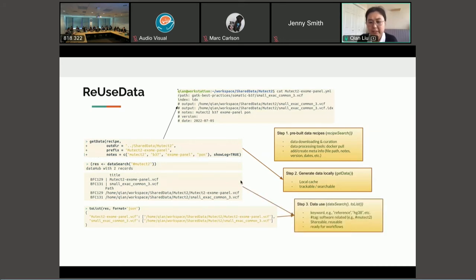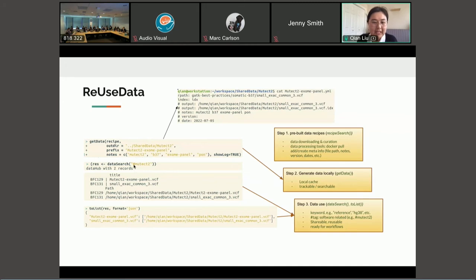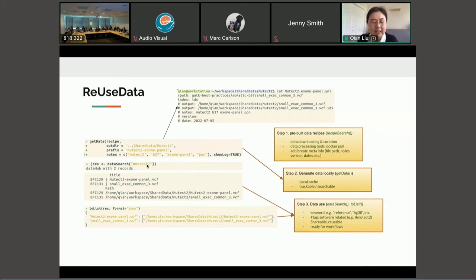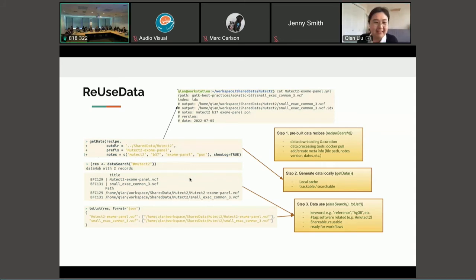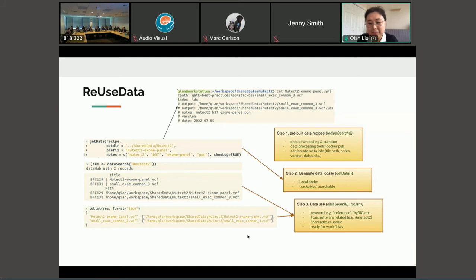The third step is to use the data. We can search the data using keywords by simply adding the hashtag Mutect2 over here. And the specific feature of our package is that we use the hashtag to denote a specific tool that can return all the datasets that can be passed to this tool. So we have functions to add a tag when you generate the data. You can add a tag for the downstream software so that you can search it. And also when you use the data we have convenient functions to convert the data into specific formats such as JSON so that they're ready to be passed into workflows.